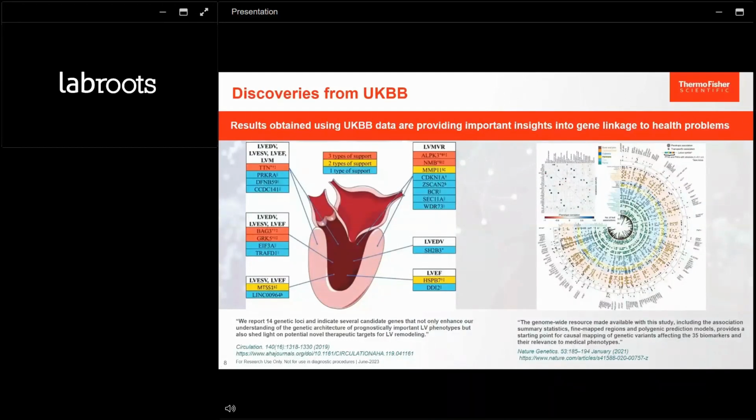On the right-hand side is a different study where investigators were mapping the link between the metabolome, the genome, and specific syndromes. And it's a very complicated figure, which I'm not going to spend a lot of time going into, but the reference does a very good job explaining the way that the link between some of these loci that are identified in the cohort that produce changes in metabolites and risk to particular diseases was possible to analyze. And again, this helps the UK scientists understand how people that have particular alleles might be at risk for either metabolic dysfunction or disease function or both.